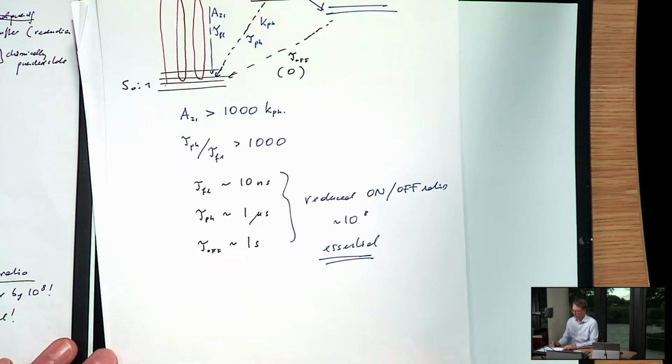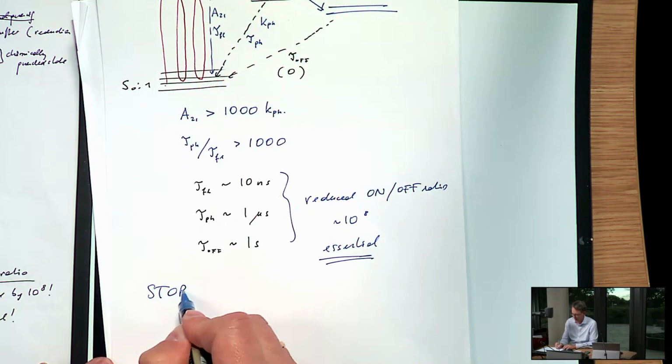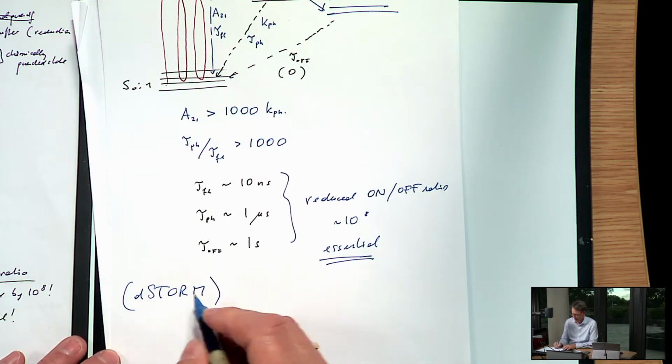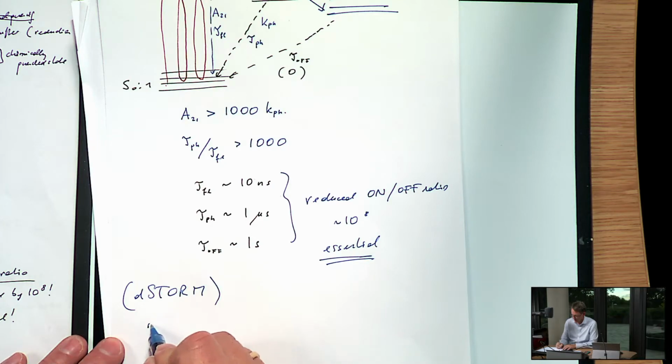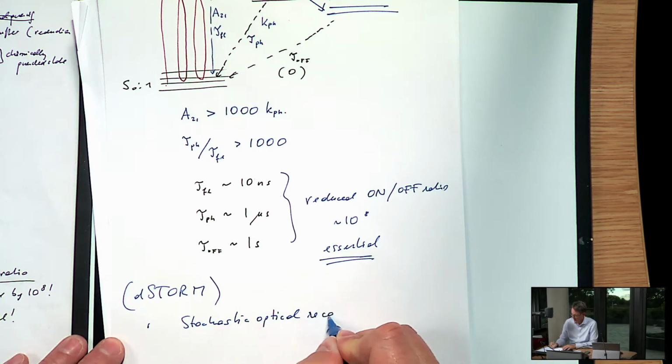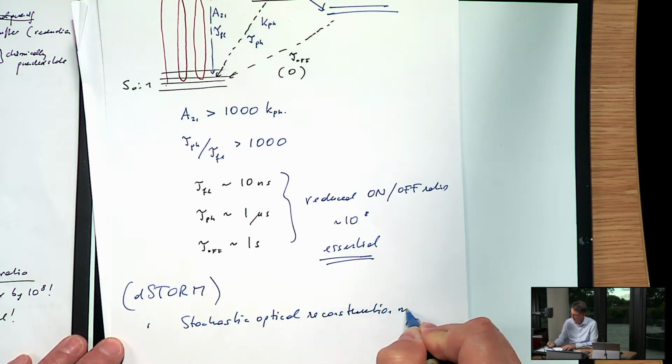This technique is called STORM, or also dSTORM in the literature. STORM stands for stochastic optical reconstruction microscopy.